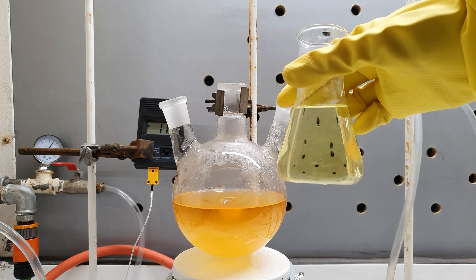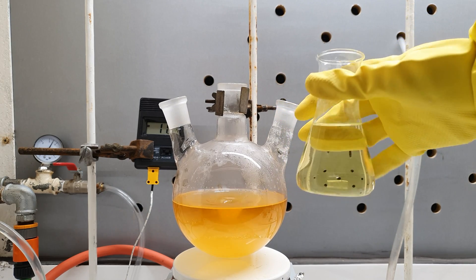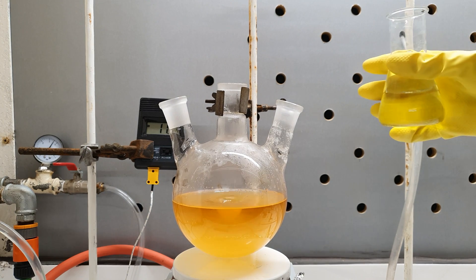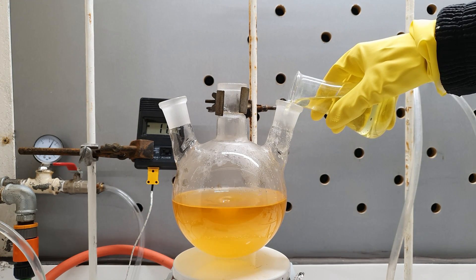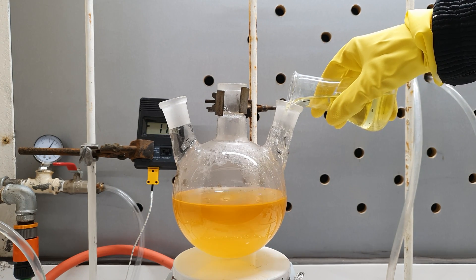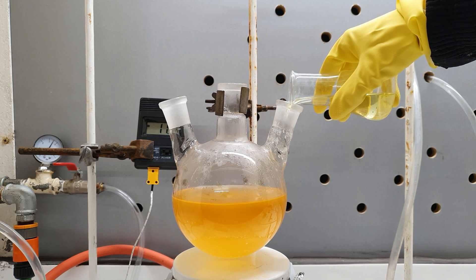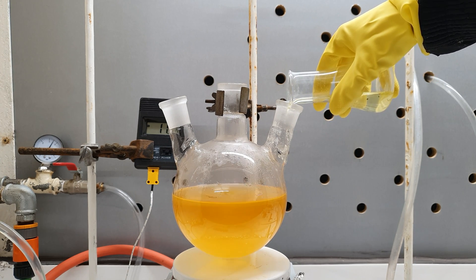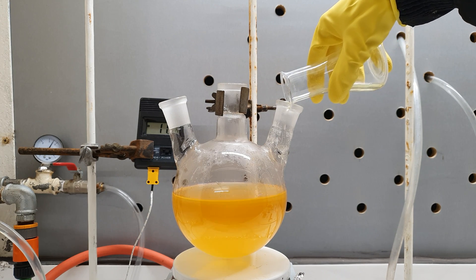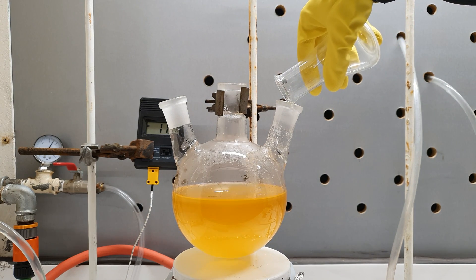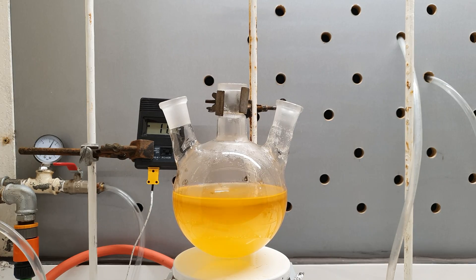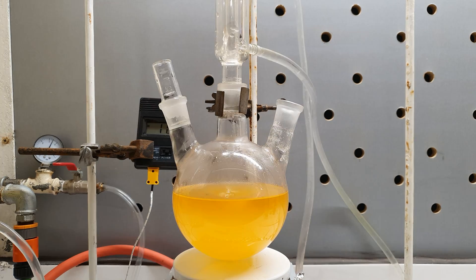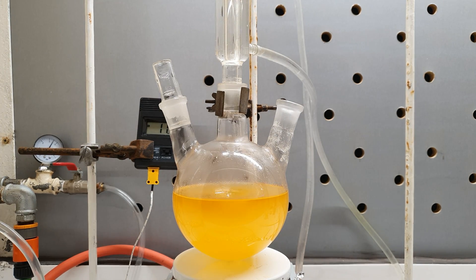Now that I had my solution mostly free from the salt, I added 88 grams of the alcohol, which in my case is 1-butanol. My butanol has a bit of a yellow color because I already used it as a solvent to recrystallize Brady's reagent — there's a video on that, check it out from the link in the top right corner. Even though I distilled the butanol afterwards, it still came out slightly yellow. Despite what 'Explosions and Fire' says, chemistry is trying to avoid things turning yellow — but it is perfectly fine and will work for our reaction.